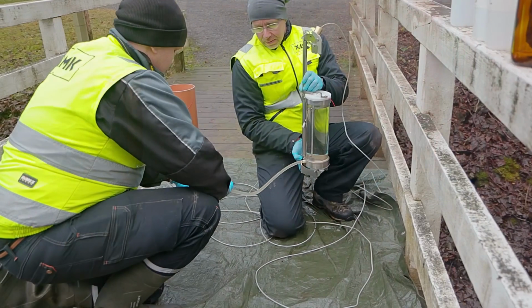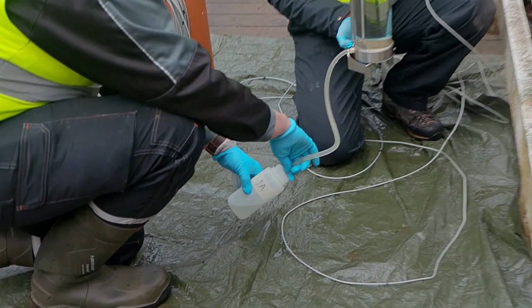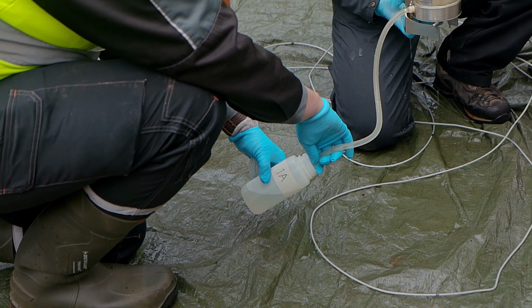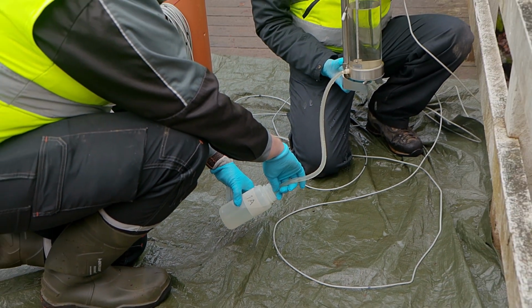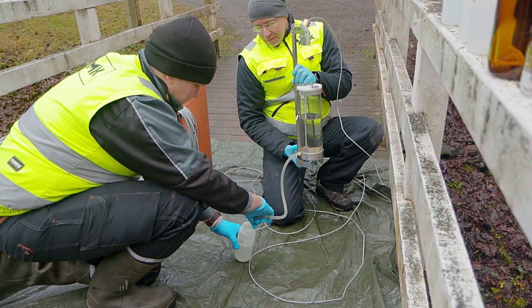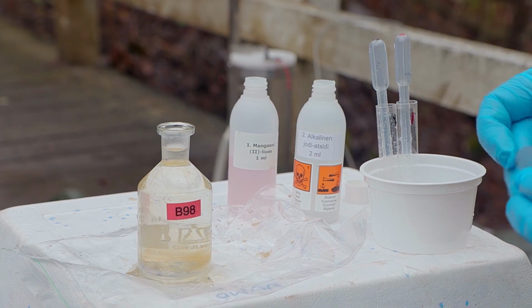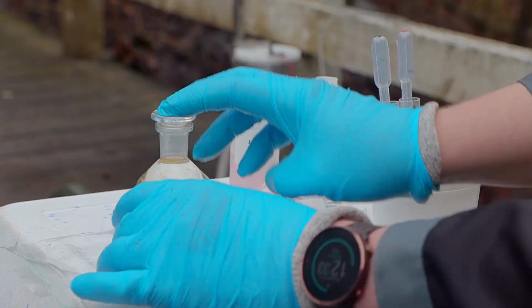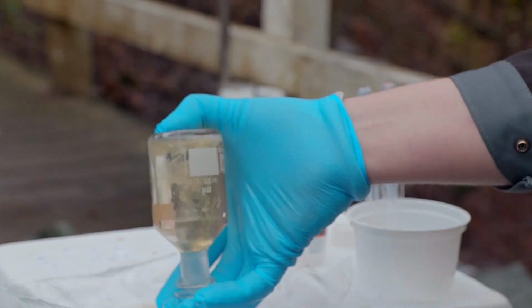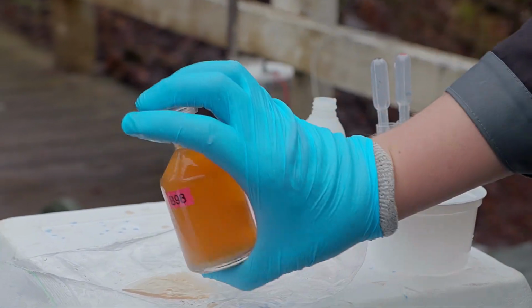The samples must also remain unchanged until the analysis. In some cases, the sample should be fixated immediately after taking it. For example, when studying oxygen content, it is important to precipitate the oxygen with fixation chemicals. This is to prevent oxygen from escaping the water sample. There may be hours or even days between the time of sampling and the final analysis. Fixation is therefore important to obtain reliable results.